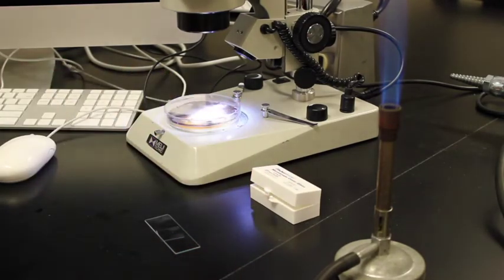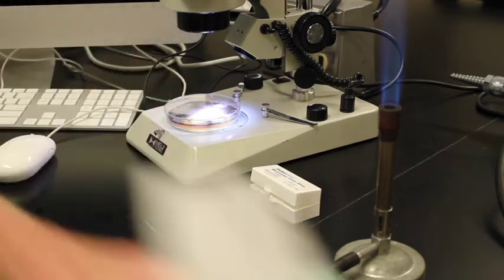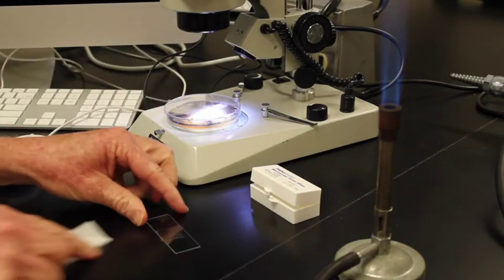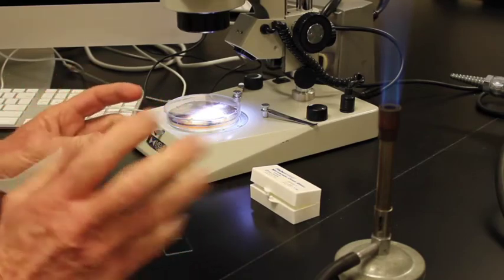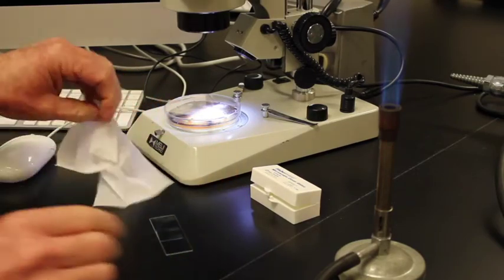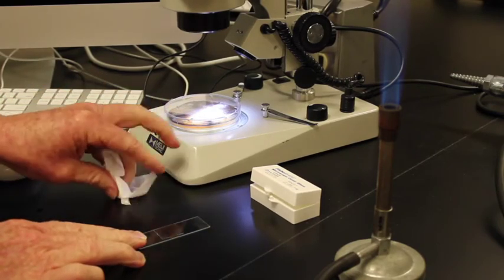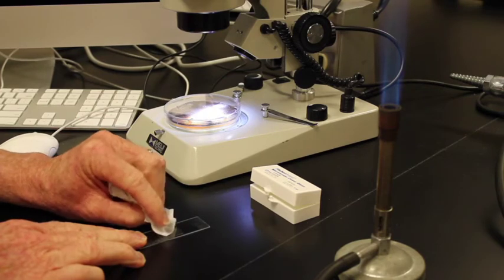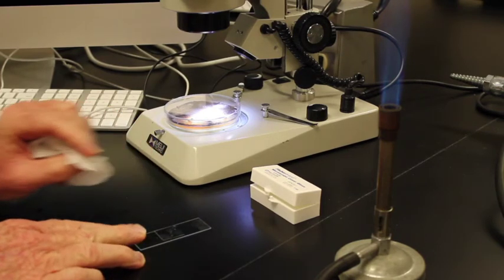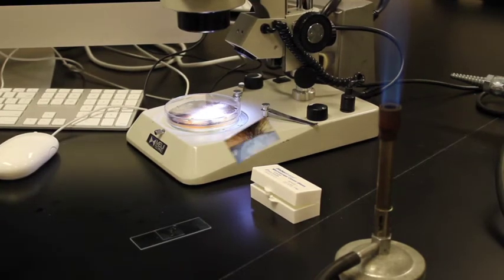Now in this case, the final step that we want to do is to take a Chemwipe and actually explode those perithecia so we get all of the spores out of the perithecia. So basically I'm going to take this. We'll just put the Chemwipe on top and gently press down to explode all of those little perithecia, little mushrooms.